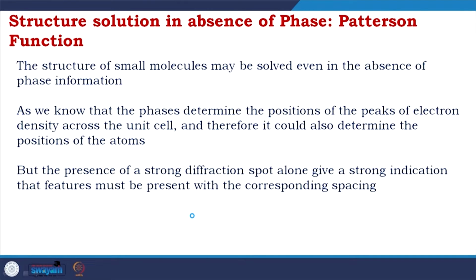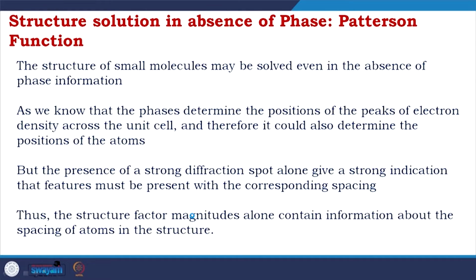But the presence of a strong diffraction spot alone gives a strong indication that features must be present with the corresponding spacing. Thus, the structure factor magnitudes alone contain information about the spacing of atoms in the structure.